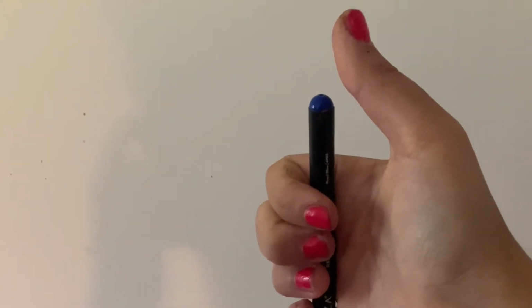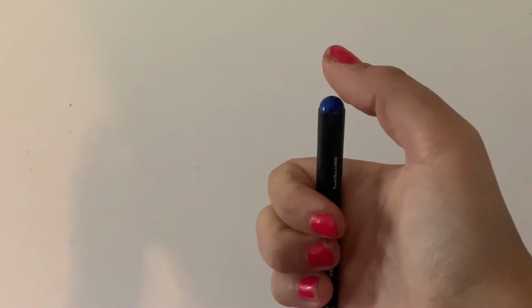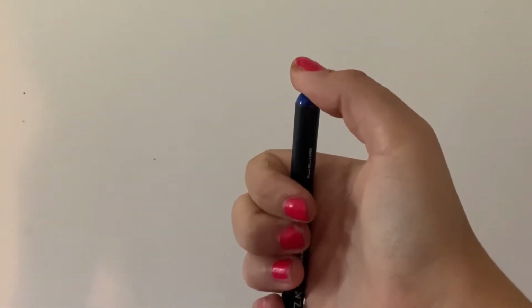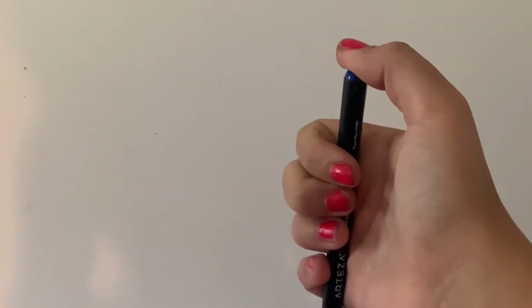Your pipette will have 2 stops on it. You will use the first one to aspirate or draw liquid up into the pipette. You will use the second stop to release liquid. Pressing down to the first stop should be smooth and relatively easy. Pressing down to the second stop will have a little bit more give to it, and that's how you can tell if you're going down to the first stop or the second stop.